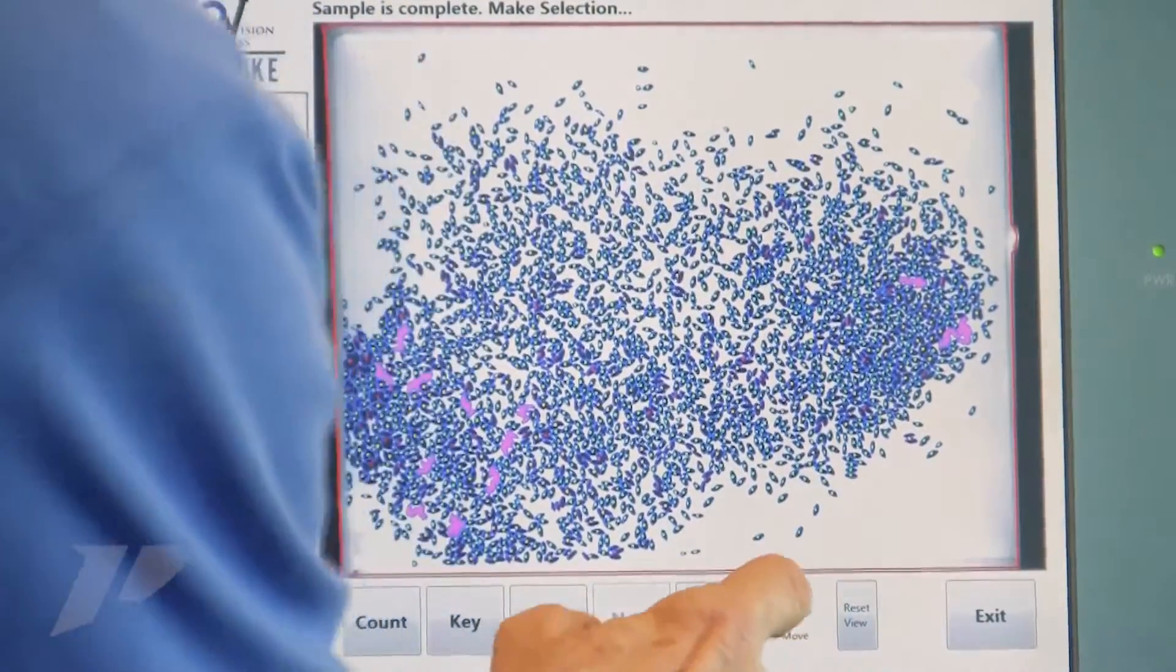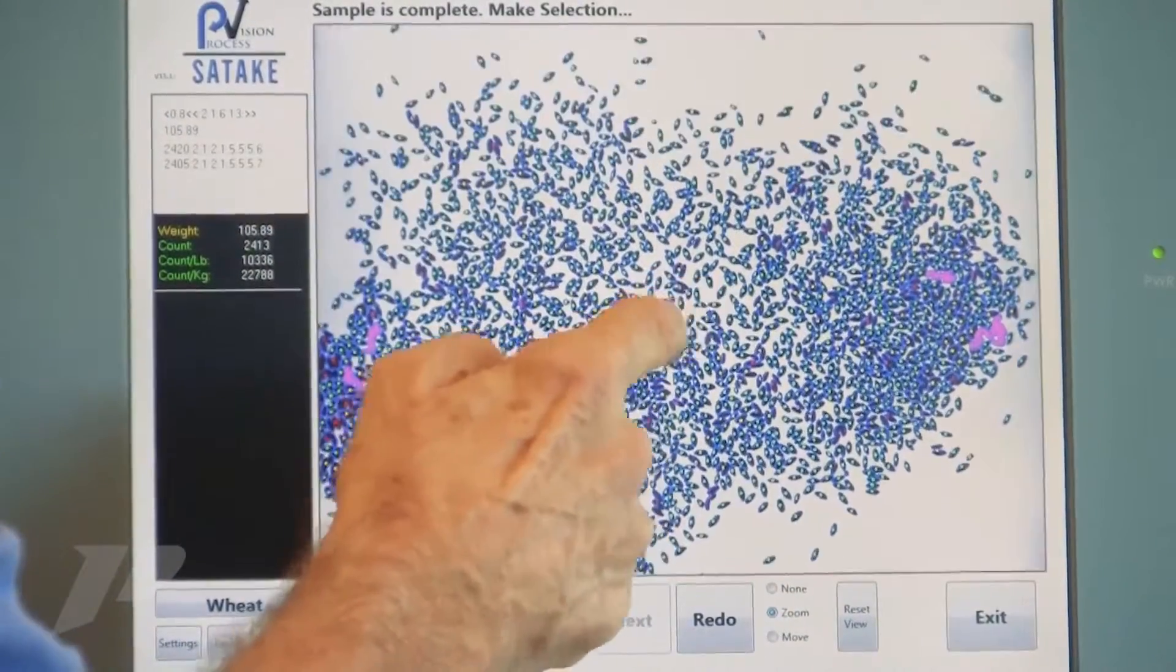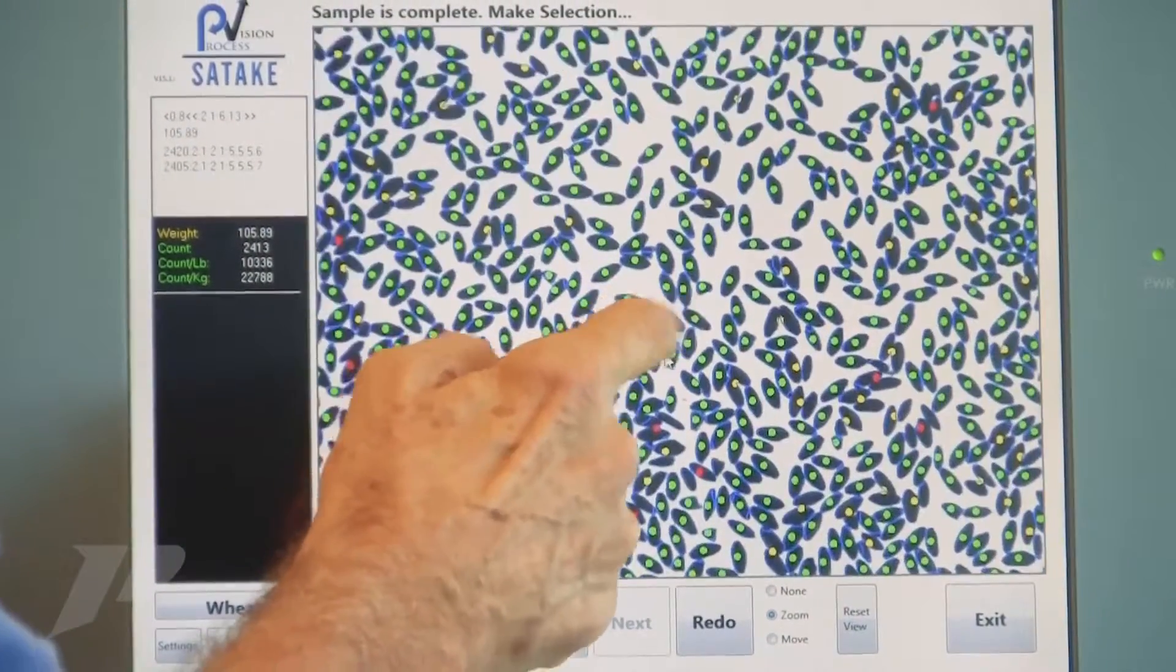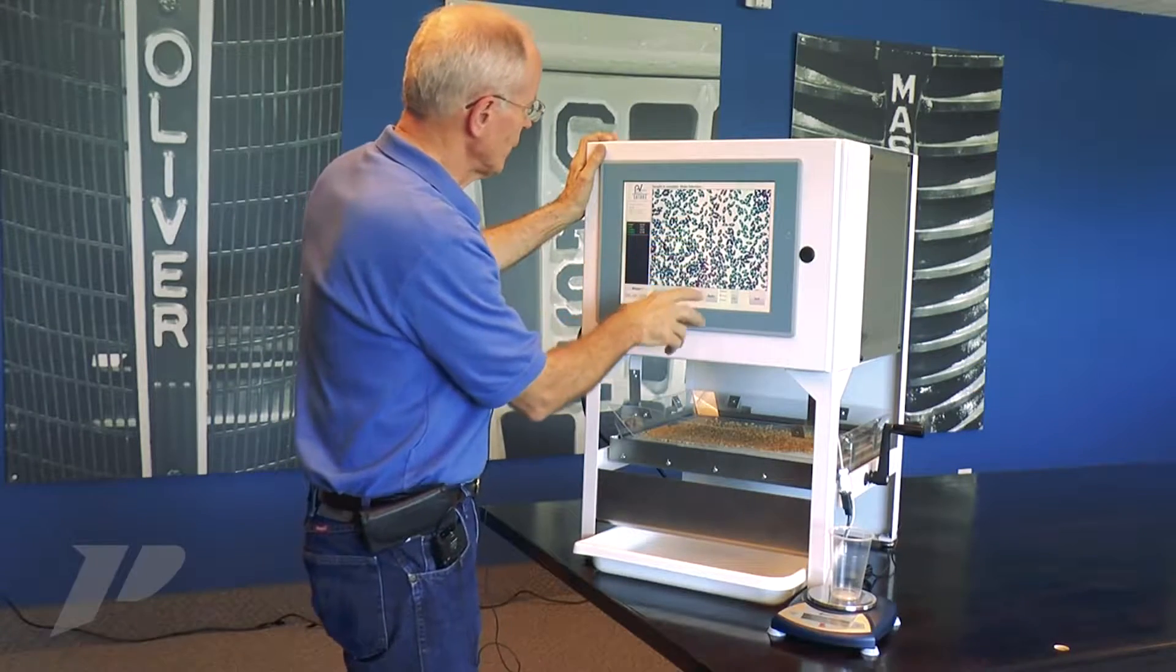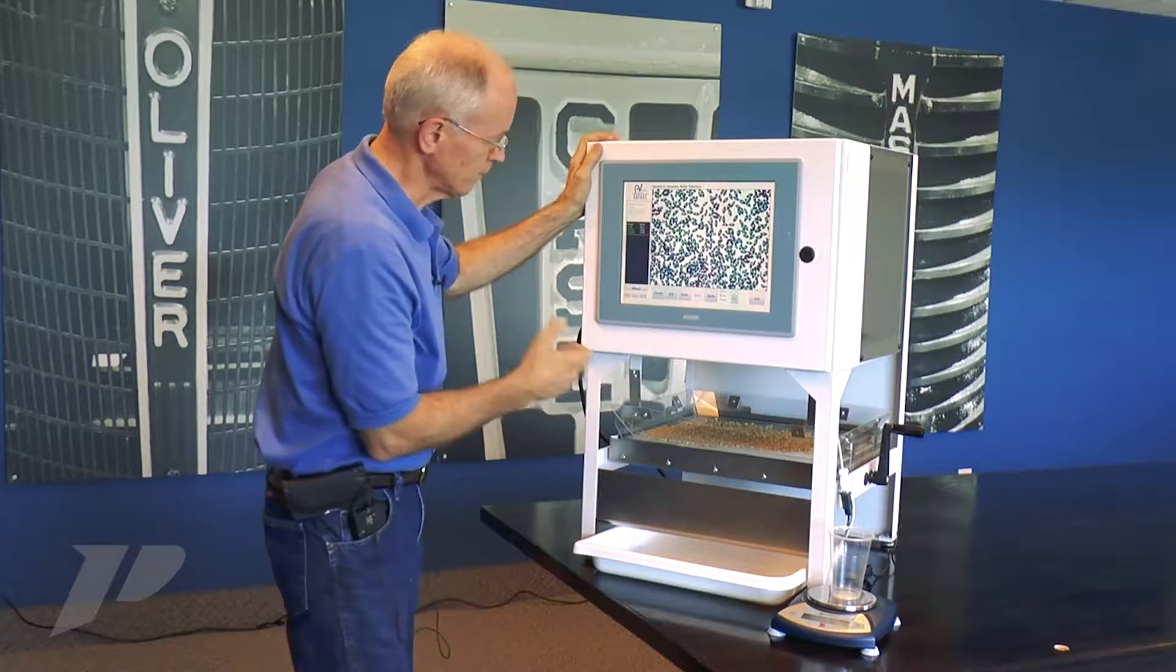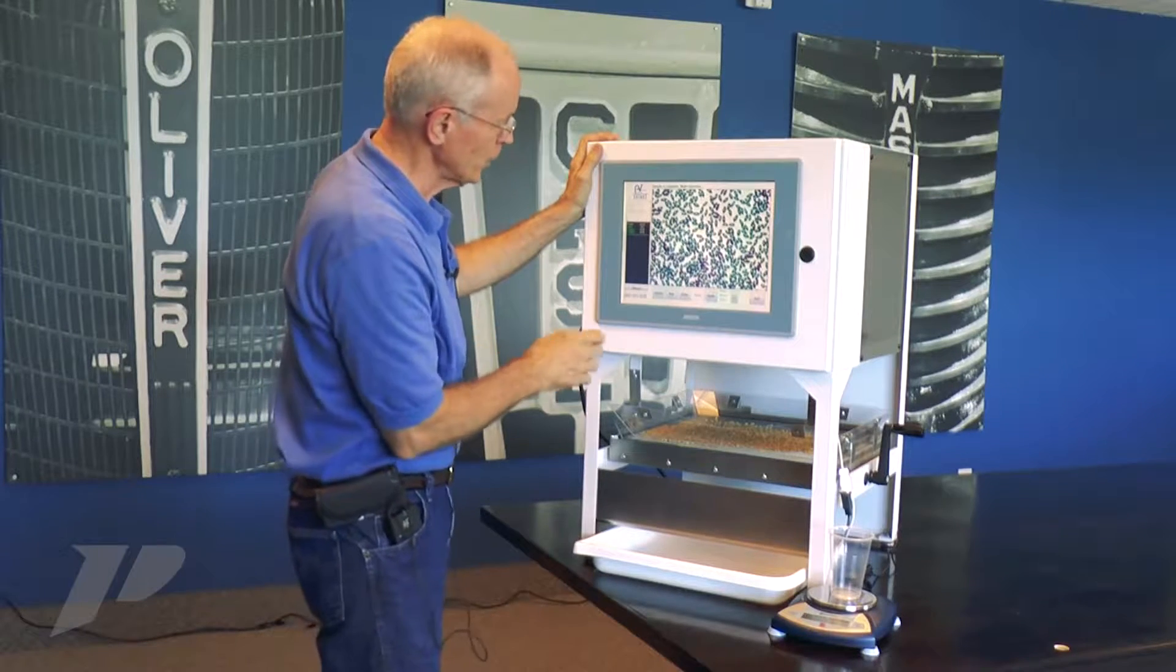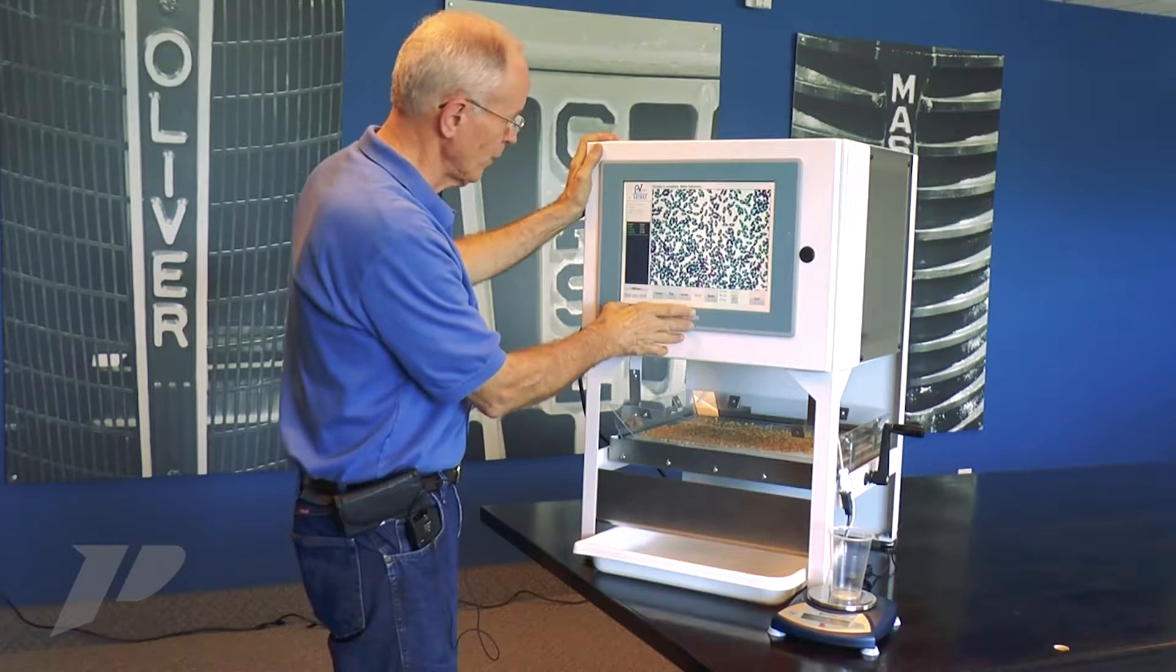If we want to look at that, we can zoom in. Click the zoom button, and I'll zoom in a little bit on the stage. You can see we have a couple small fragments. That's going to happen. That makes counting a little bit more difficult, but we can deal with that.